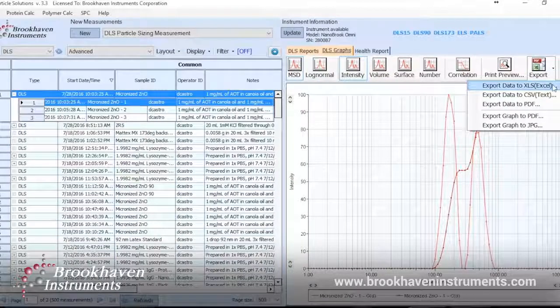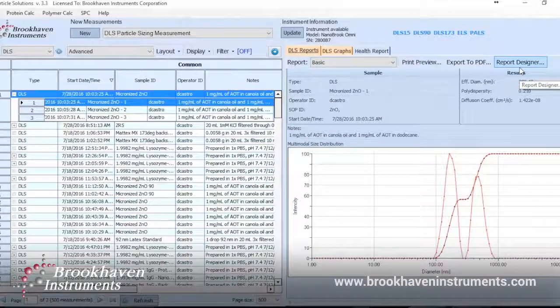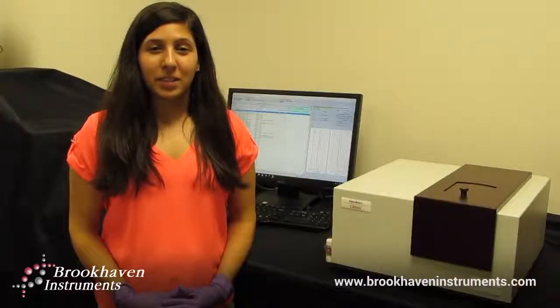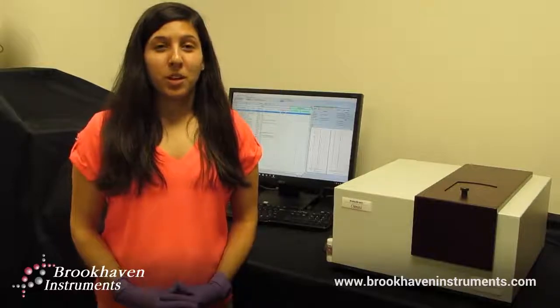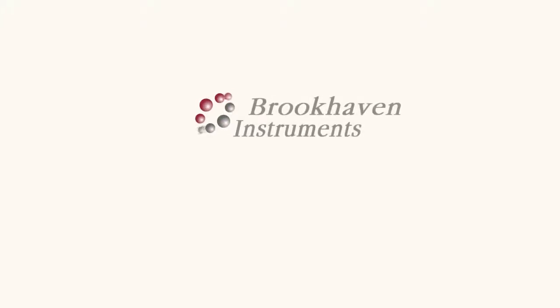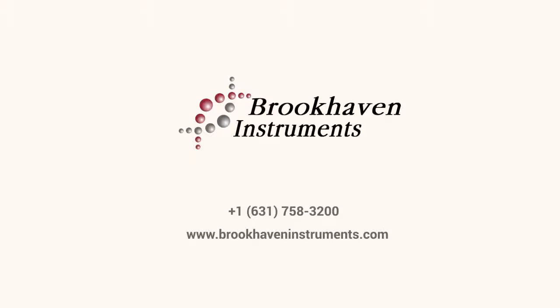Using Particle Solutions, you can print or export any piece of data you'd like in a variety of formats. There is even a report designer where you have the option to pick and choose the information you'd like displayed in a report. The latest update to our Particle Solutions software suite is LIMS export capability, so you can easily incorporate results into any external LIMS software to seamlessly participate with your lab's processes. I hope you have seen how useful dynamic light scattering on a Nanobrook Omni can be with sensitive samples such as cosmetics. Stay tuned for more videos where Brookhaven Instruments explores various applications, and visit our website at BIC.com.